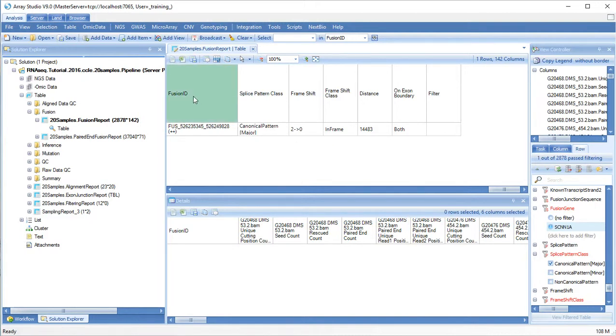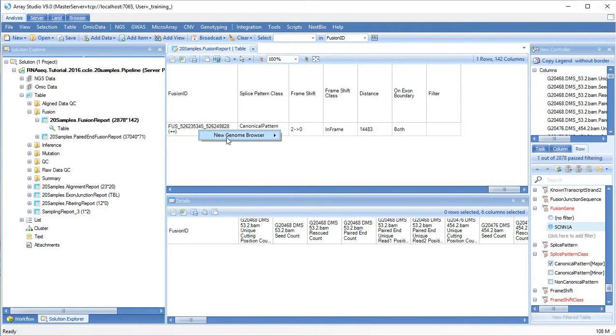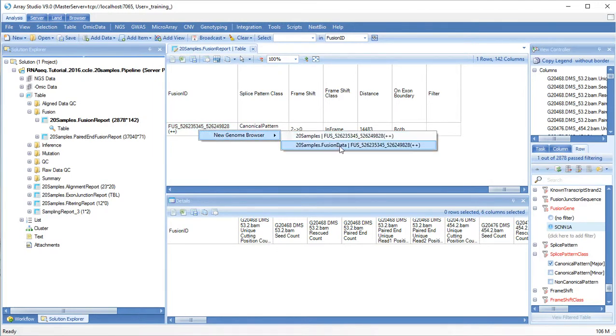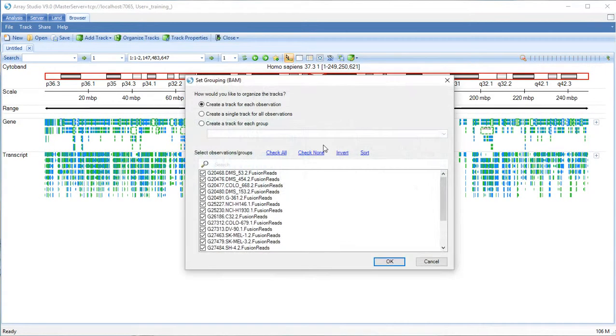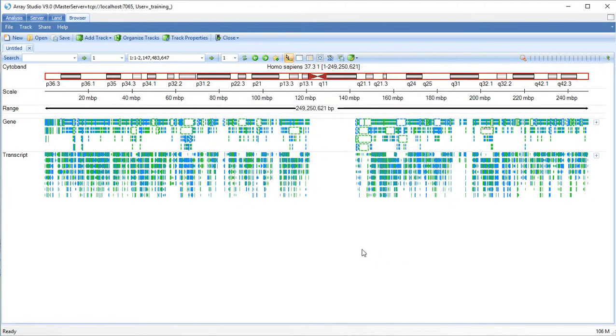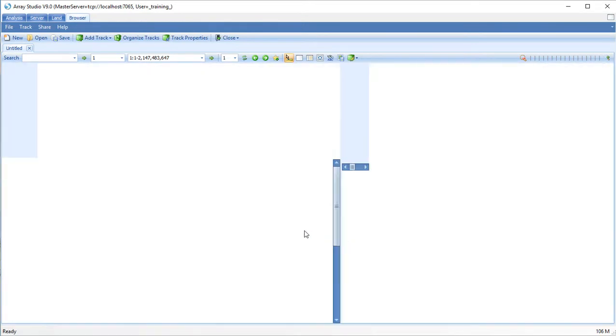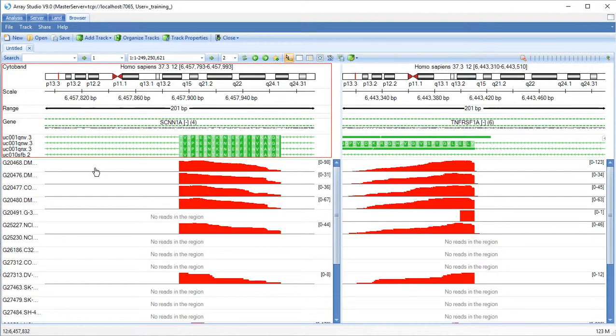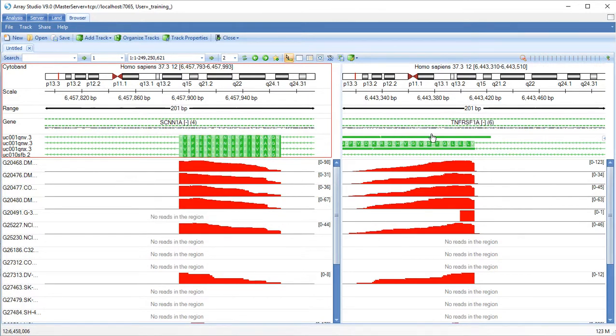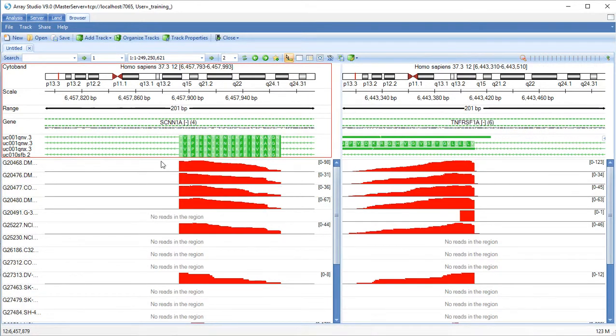We can directly look at fusion data in the genome browser. Choose the fusion data which include only the reads that were mapped in the fusion map. Both genes are in the reverse orientation. Let's swap the panes.